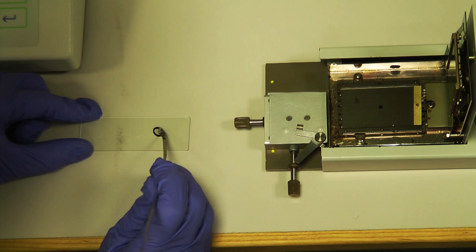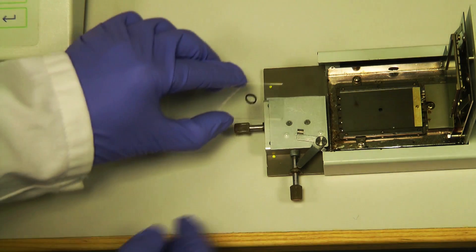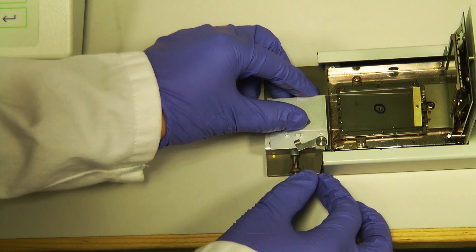Place a small amount of sample, at most a few crystals, within the marked area. Cover with a slip and slide the sample back into the stage, then close the lid.